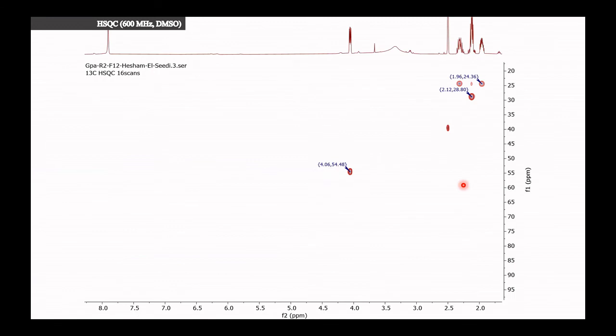Look at this. Here, proton NMR. Why? Chemical shift until 8. In this direction, it is until 99. Of course, it can be until 220, but since you don't need it, it is in the range of the aliphatic still, it means proton and the carbon. So it will be proton and carbon correlation spectroscopy. It means it is one kind. The first kind of this correlation is called HSQC. What is the aim of HSQC?